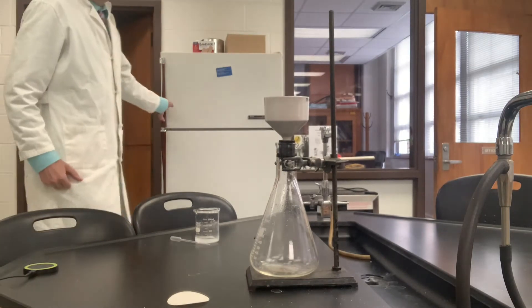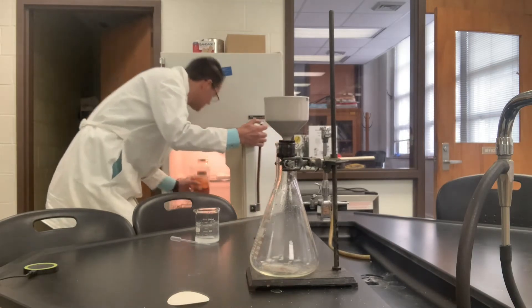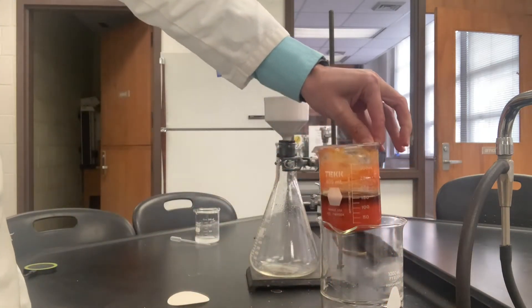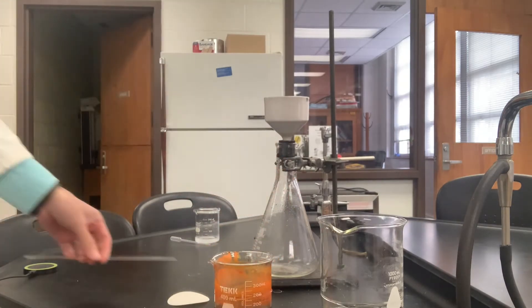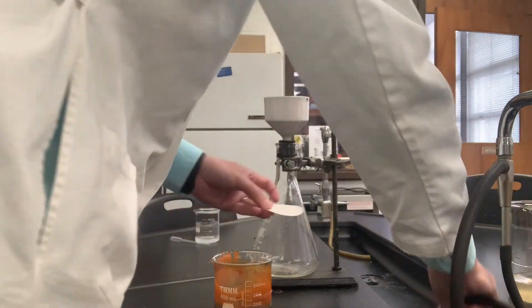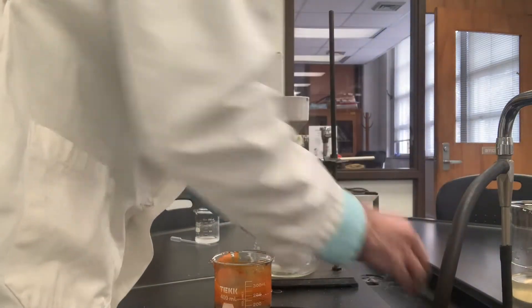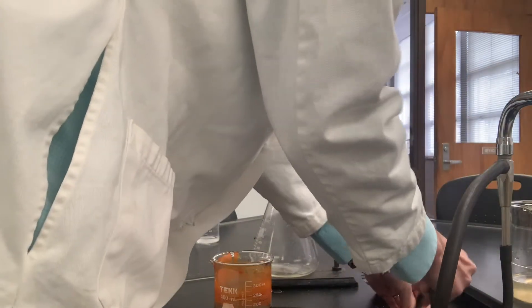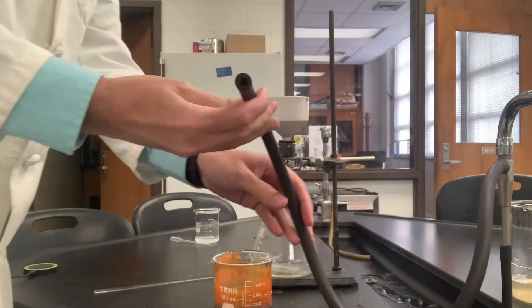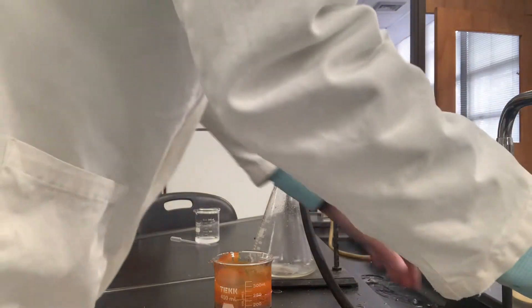I'm here ready to isolate the methyl orange product. We've chilled this to an ice cold temperature for quite a while. This is where things get pretty messy. We want to wet the filter paper with some water here, only because the reaction was carried out with an aqueous solution. We'll hook on the side arm here, which applies the vacuum, and get that running at a good rate.